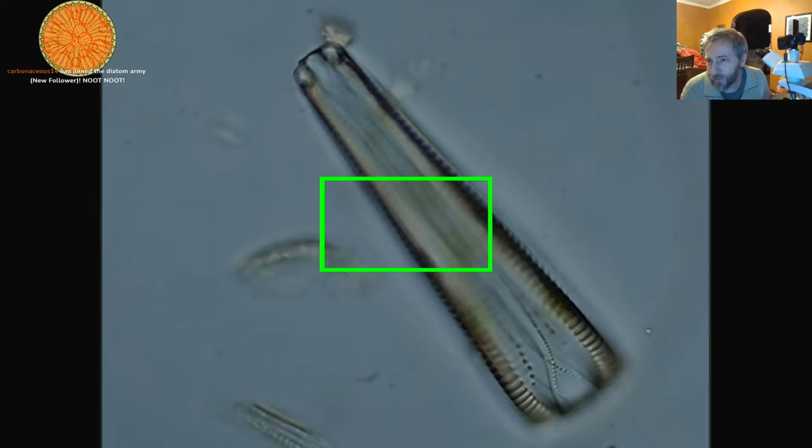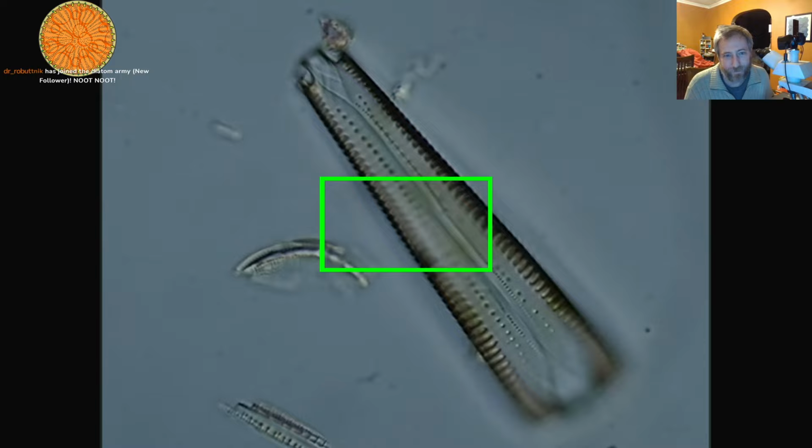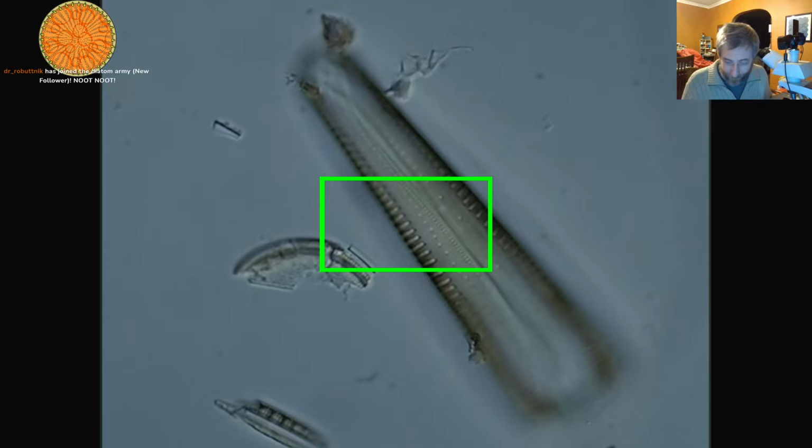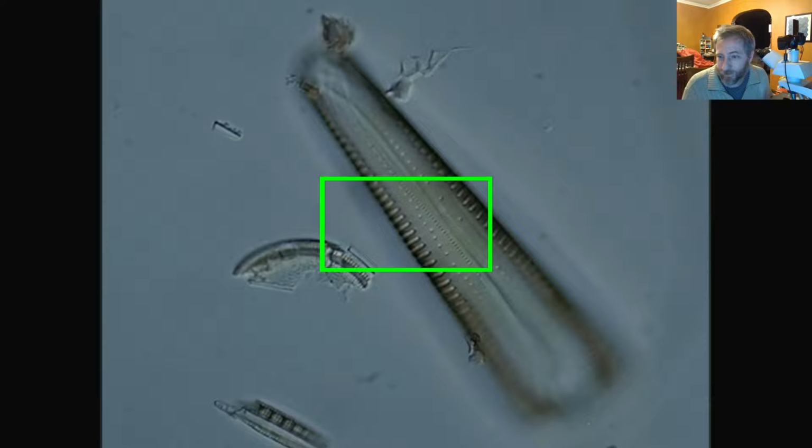While we're roaming through these things, let's see. How are the diatoms tonight? The diatoms are good. This was like Bigfoot I was looking for in my SEM, and I thought maybe I hadn't found it, but in fact I had found it. So this is our cryptid diatom that shouldn't be, but that we actually found. So I was looking through the sample. It's pretty rare in the sample.